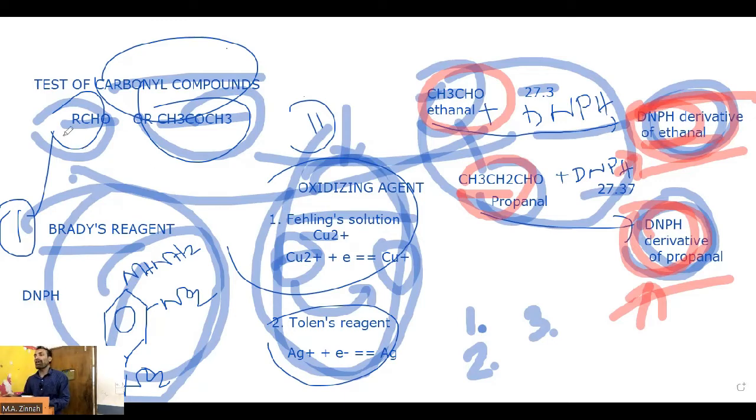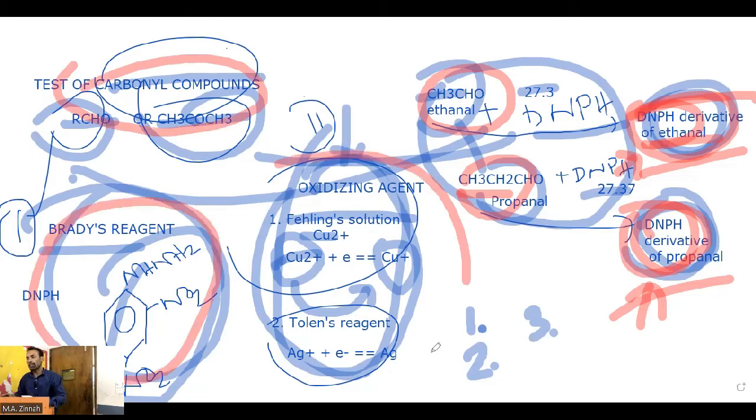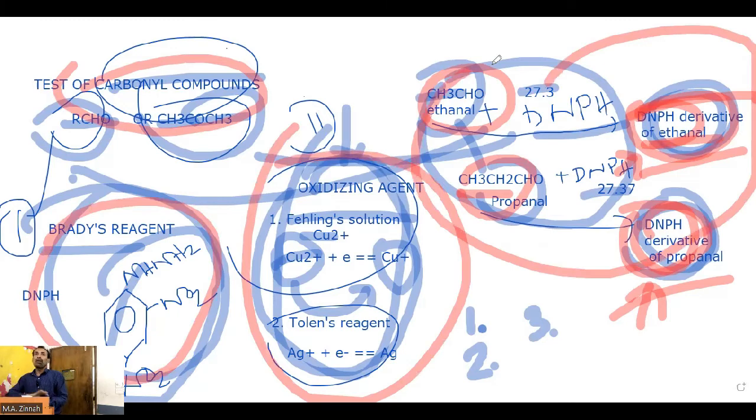So we are having three tests. This was the general test to identify any carbonyl compound, this distinguishing test, and this is a very precise test to identify a particular compound. This is not testing for any homologous series. Particular compound কে আইডেন্টিফাই করা হচ্ছে by measuring melting point of the derivatives. কিন্তু এখানে একটাই ইস্যু বাকি থাকলো এখন, মেল্টিং পয়েন্ট ডিটারমাইন করতে গেলে তোমাকে যেটা করতে হবে সেটা কি, what is that, পিওর করতে হবে, পিওর. ওকে, substance needs to be pure.